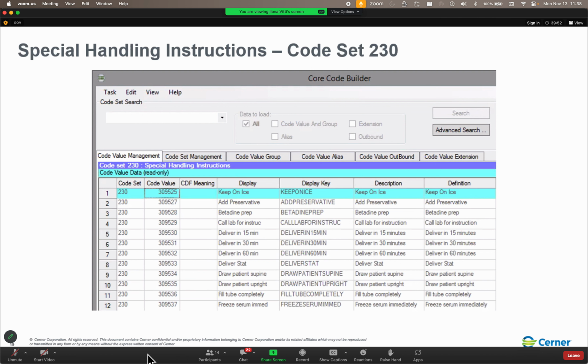If you're afraid to copy something wrong, you know what? That's where you just double check. You double check your DCW and you go, okay, yep, this looks like a bog standard chemistry order. You pull up a bog standard chemistry order, and as long as it matches what's on your DCW for your new orders, feel free to copy away.